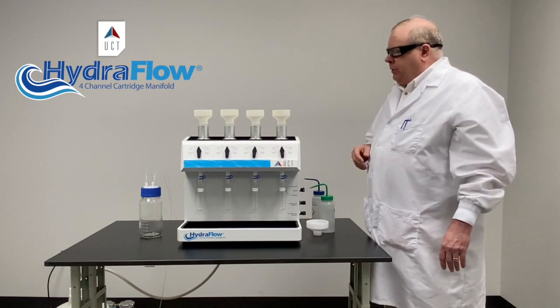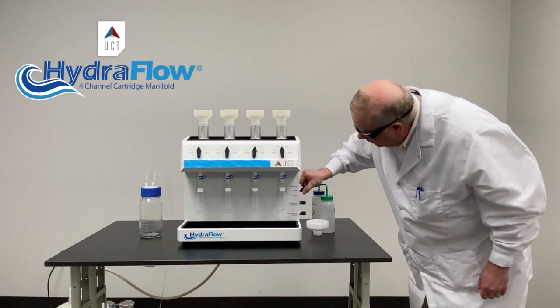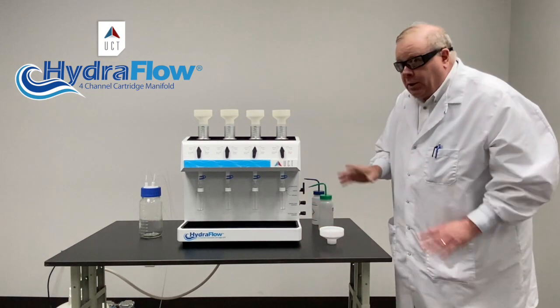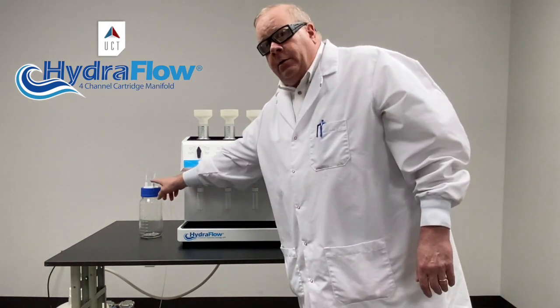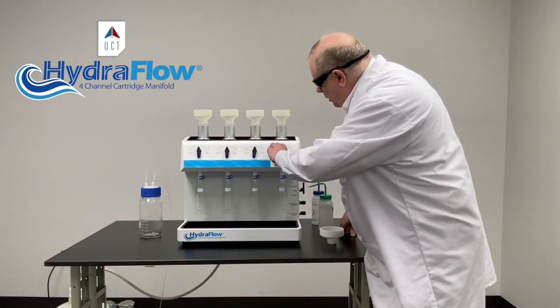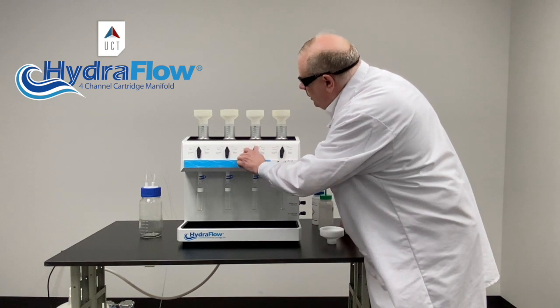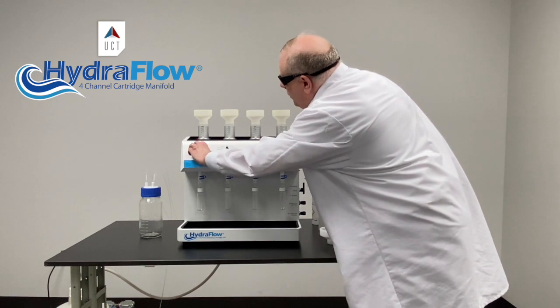Once the methanol is finished doing its thing, we're going to send it to waste, so we're going to turn this to organic. We're going to turn on our waste vacuum — which you can hear running in the background — and this is going to send our organic waste to this container. We go to waste until the methanol is right where we want it, then we stop. I'm turning the knob to low just to give it a little bit of flow and get the methanol out.